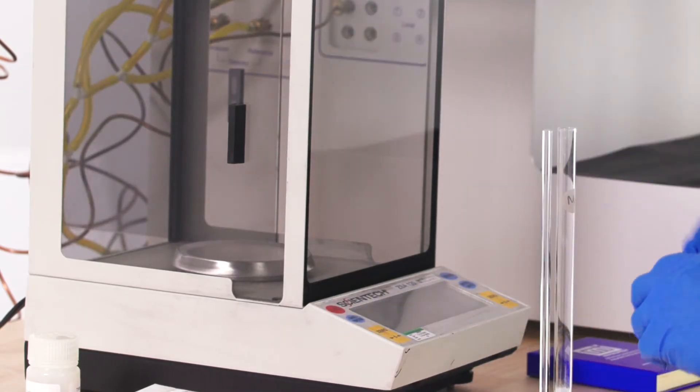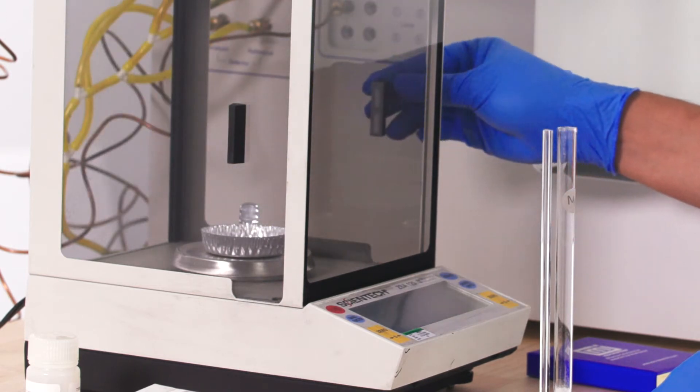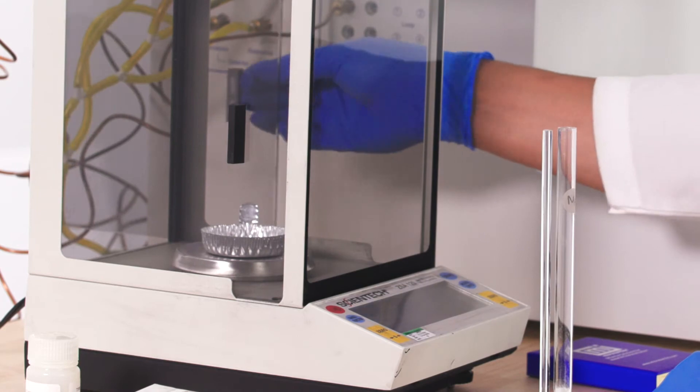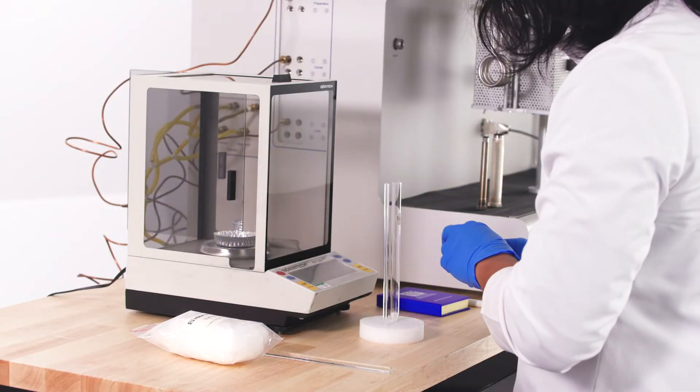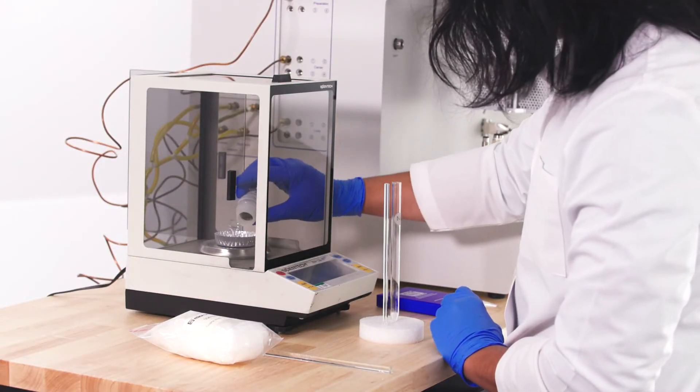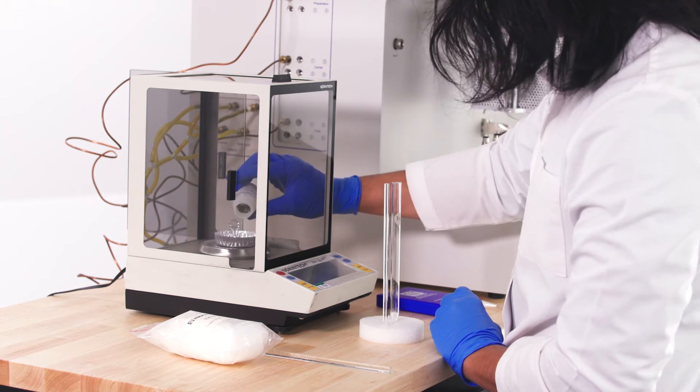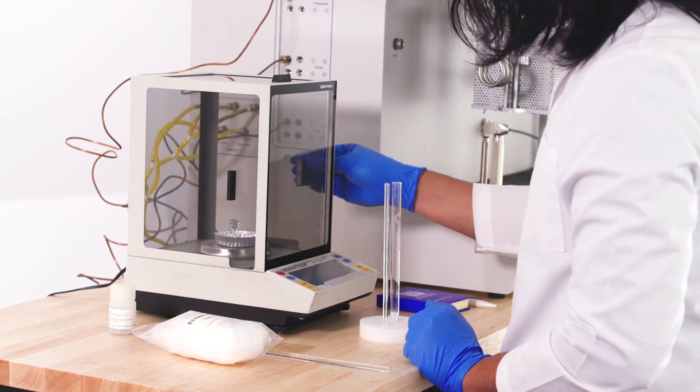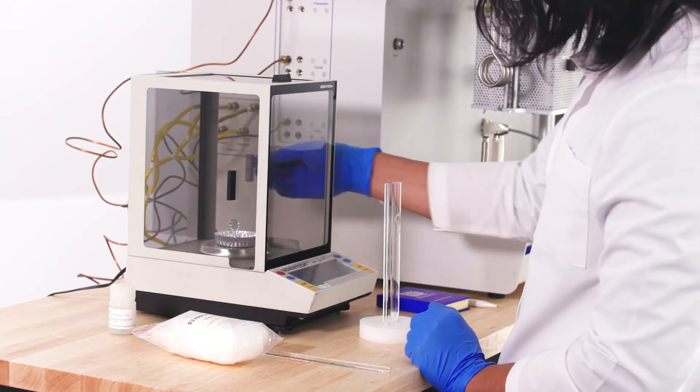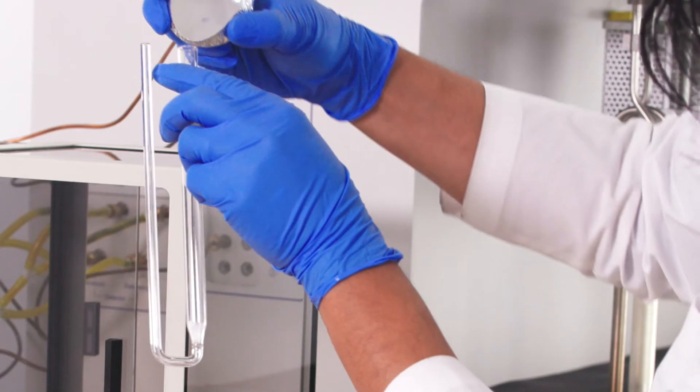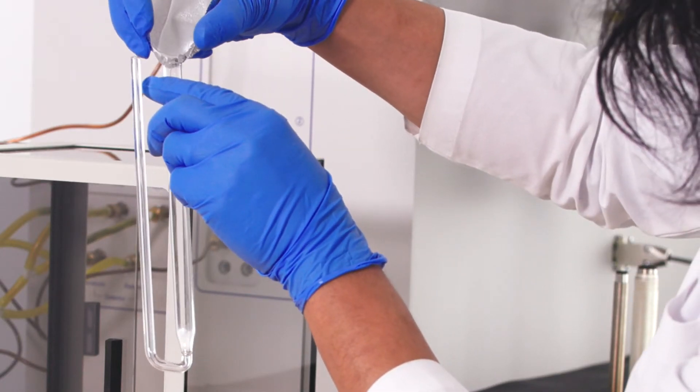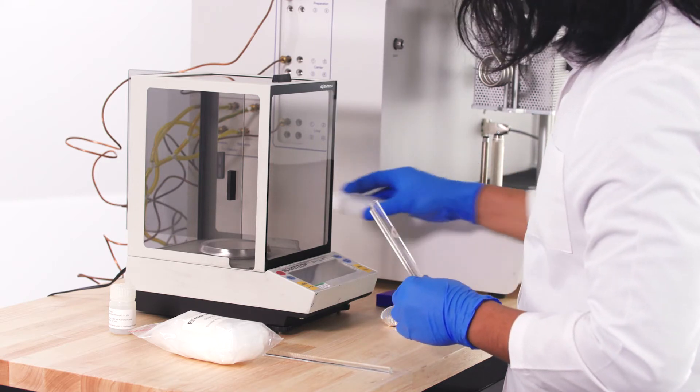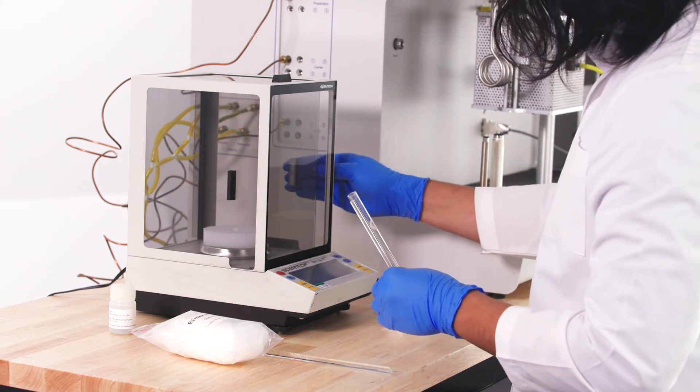Measure between 0.5 to 1 gram of platinum alumina and transfer into the sample tube. Re-weigh the mass of the sample tube with the sample.